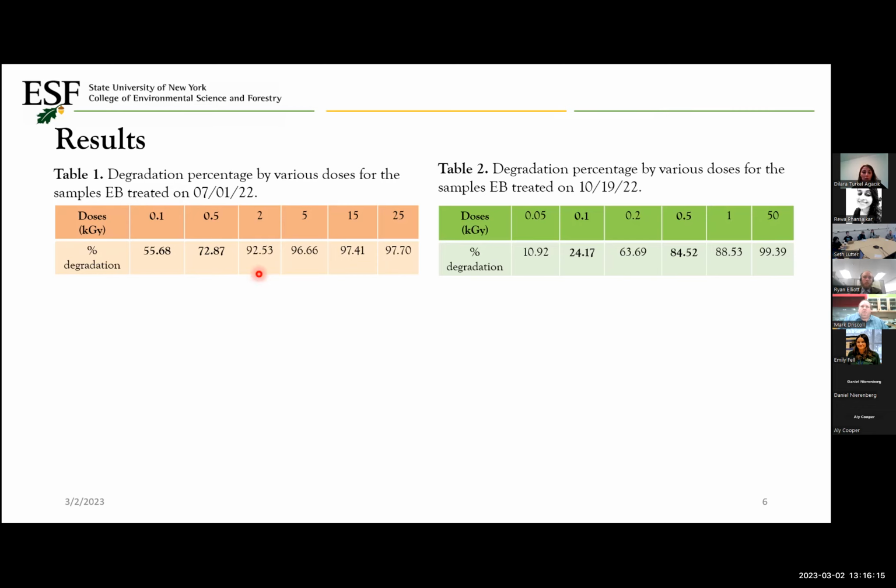irradiation dose. So after getting these results, we also collected another wastewater sample in October and wanted to check the degradation percentage for interval doses, such as 0.05, 0.2, and 1 kilogray, by keeping two doses as a control with the previous batch, which were 0.1 and 0.5. We also increased the highest dose to 50 to check for any changes in the degradation percentage. However, the results show that there were some differences at the control doses.